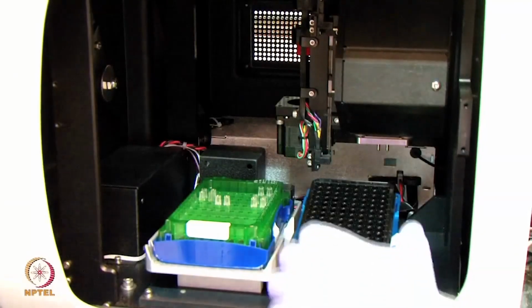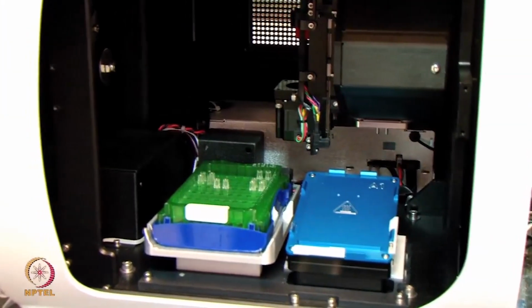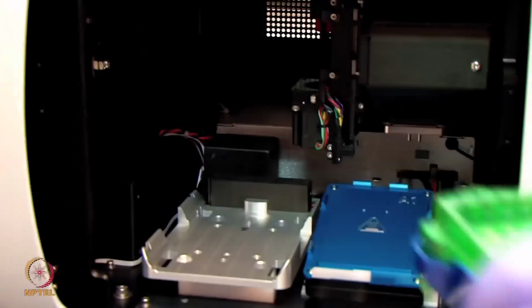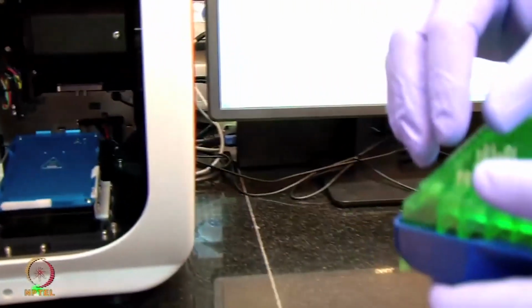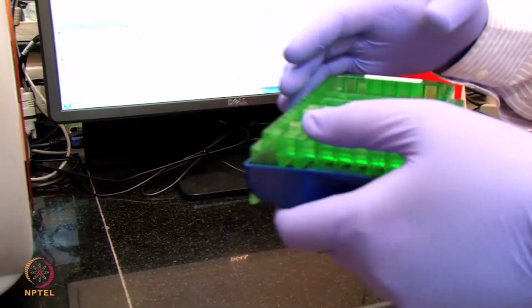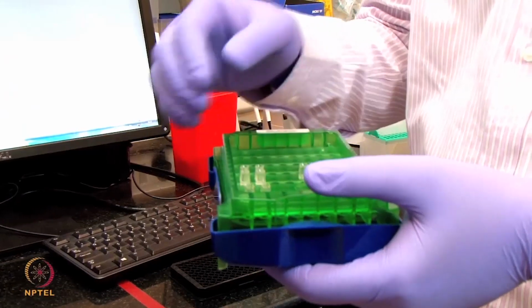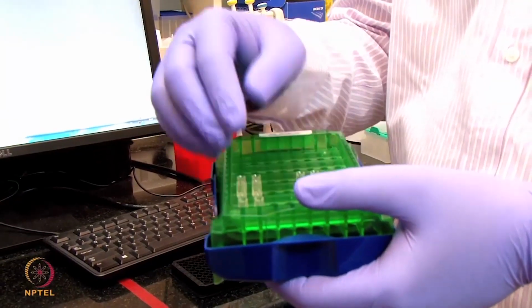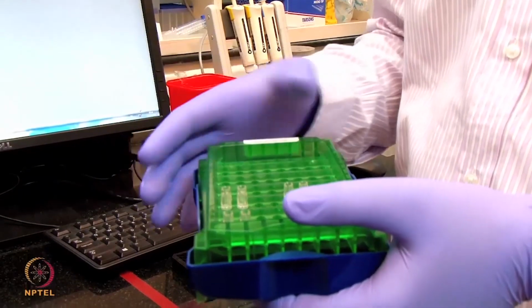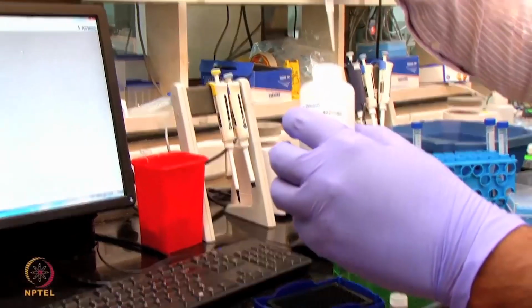Now I am going to take back this sample plate and also the sensor tray. This sensor is hydrated in the PBS buffer, and our biotinylated antibody is also in the PBS buffer. Now I am going to equilibrate these sensors with the PBST buffer, the PBS buffer having Tween in it. We call this PBST buffer the sample diluent buffer.